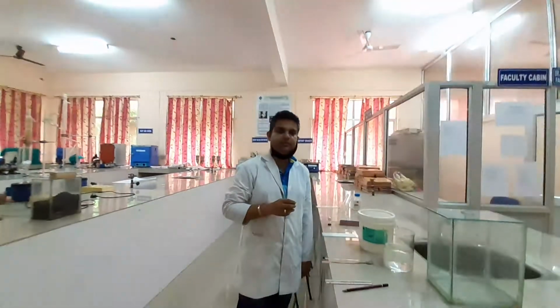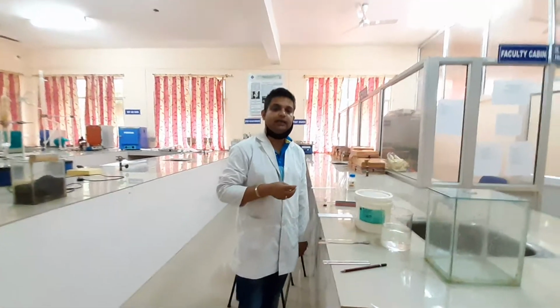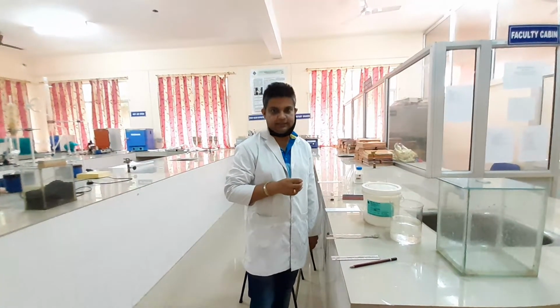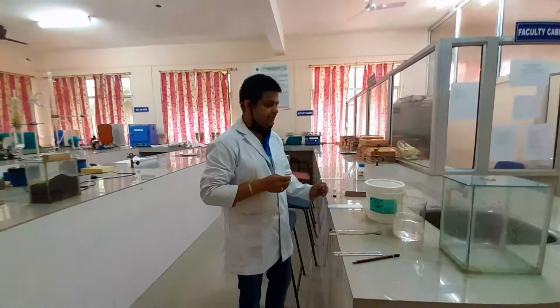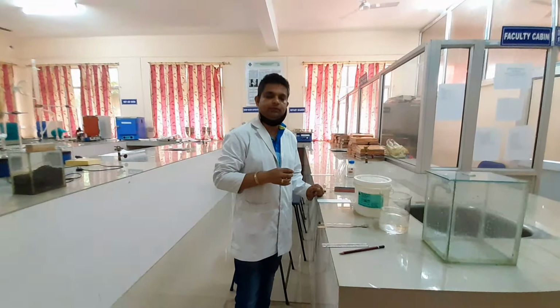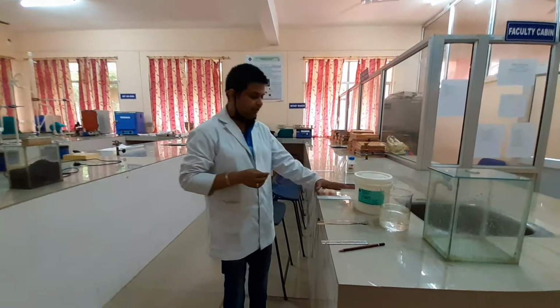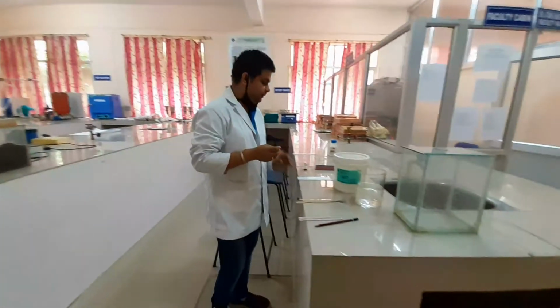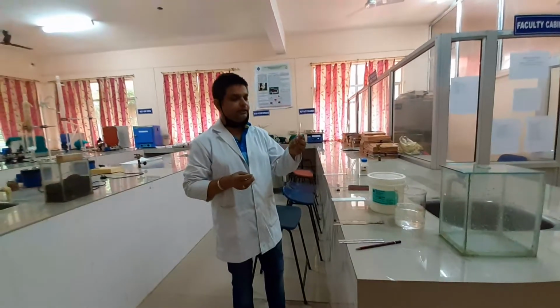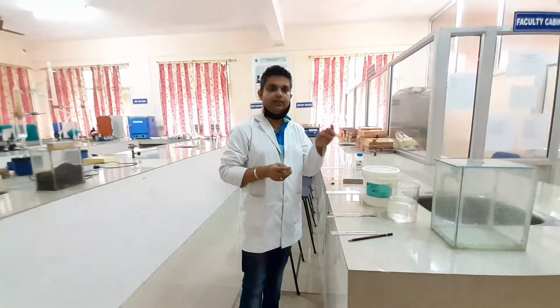So in today's experiment, we are going to perform another TLC method. This is the TLC of amino acids. As in our previous class, we have already prepared the TLC plate. This is the ready-made TLC plate available here. You can see here, this is the standard amino acid in solution form.